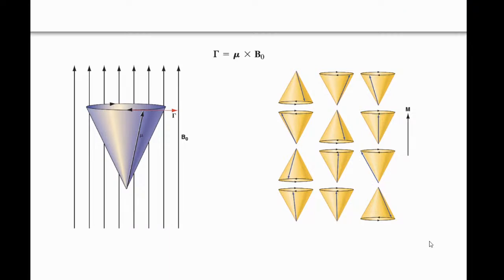Now, of course, we are not dealing with single spins. Always remember that we are not dealing with single spins. We have a huge amount of spins in the sample. Avogadro number: if you have a one molar sample of H2O, then you have 6.023 times 10 raised to 23 molecules of water in that NMR sample. So that means twice that because they have two hydrogens, right? Forget about the oxygen. So many spins will be there, and we have to deal with them in a different way.